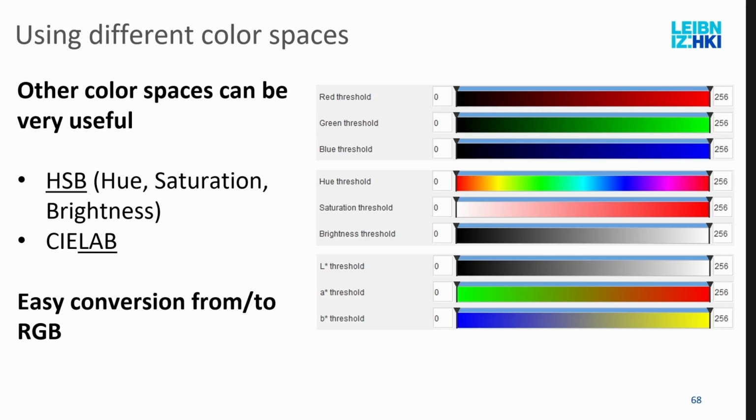And then the fancy one for scientific usages is more common. You don't usually find it in standard image editing software like Photoshop. It's just a different way, where you have here luminosity, and then an axis between red and green, and then an axis between blue and yellow. For example, JIPipe will help you convert them between these different types for usage.